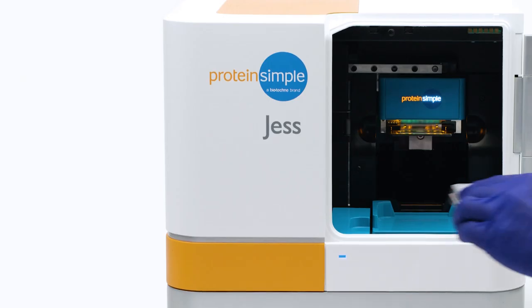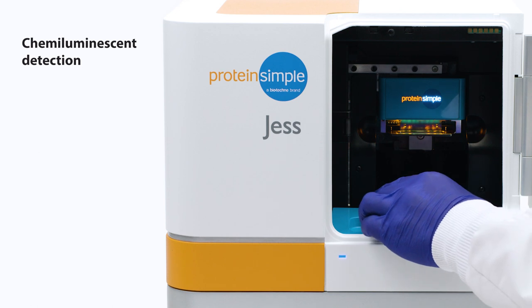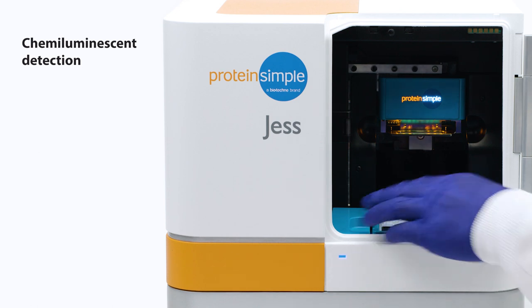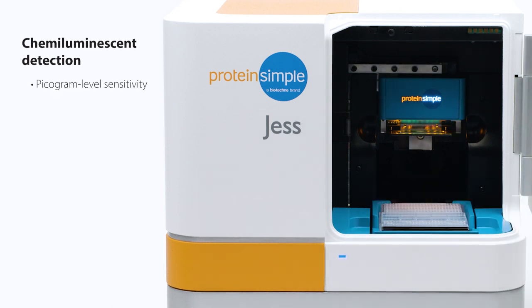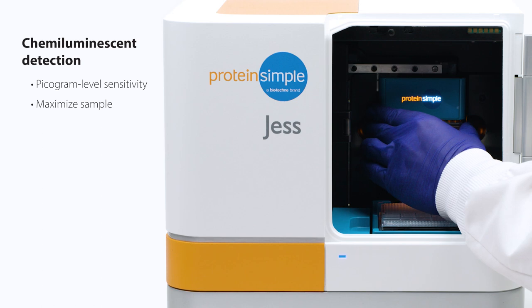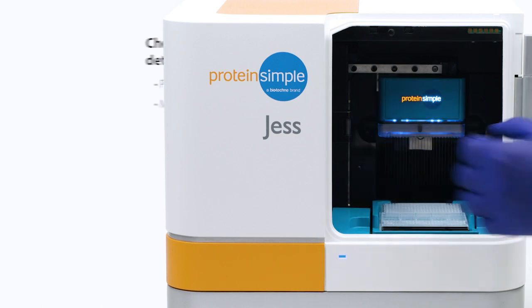With Jess's chemiluminescent detection, you'll get picogram level sensitivity, letting you maximize the data you get from your sample.